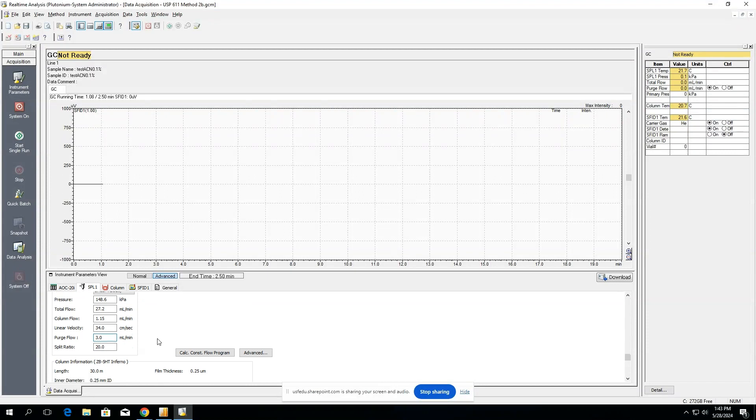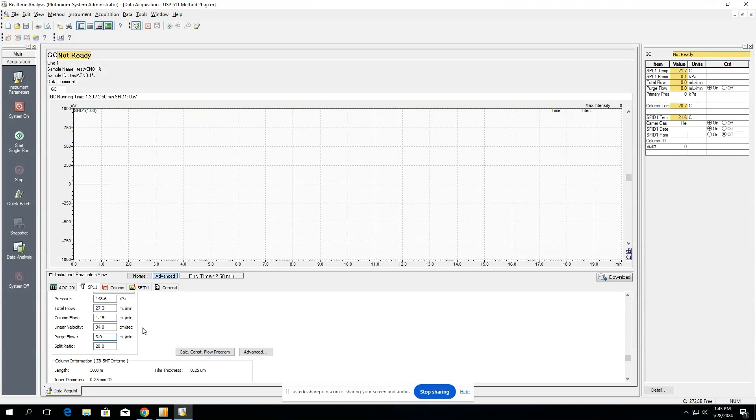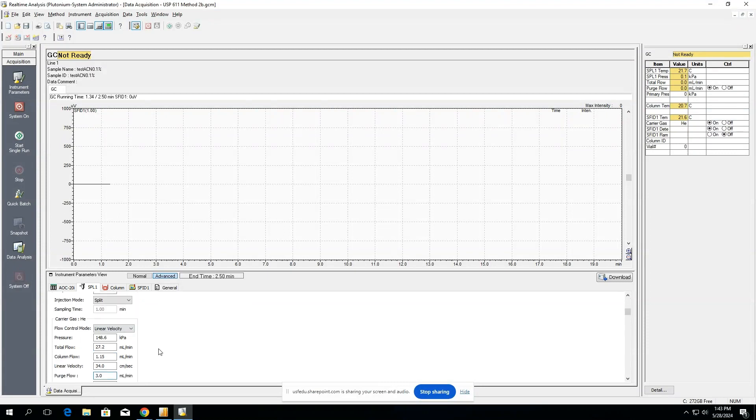You want to make sure that you have your column information installed and this is going to be accurate to the column that you physically have. If it does not match the inner diameter, the film thickness, and the length, you will have issues while running. So make sure all of these parameters match what you're running in your method.